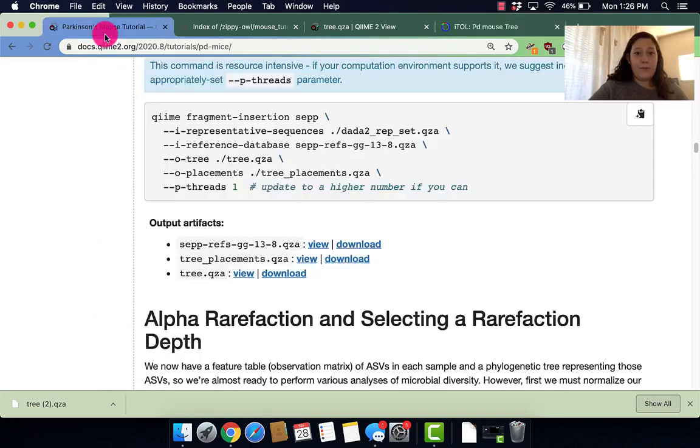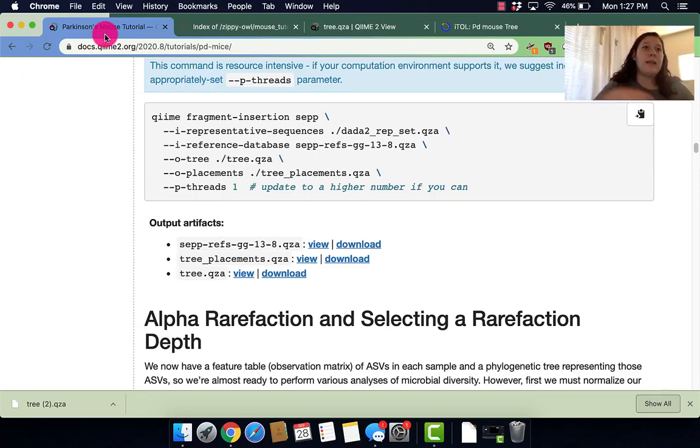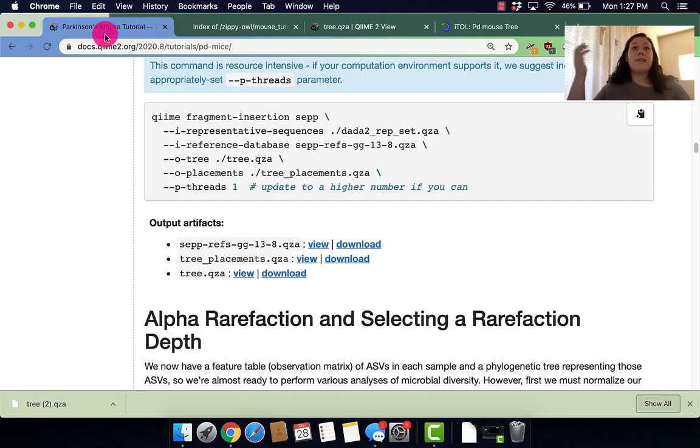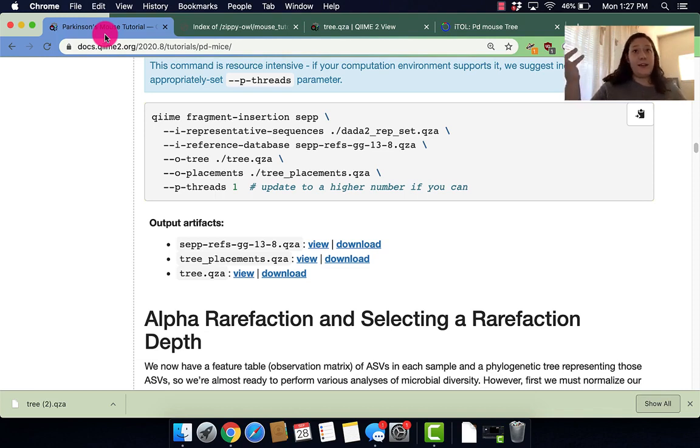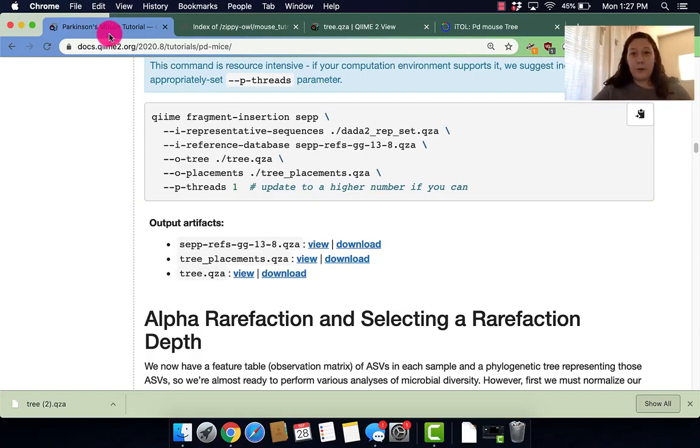Very cool. And with that, we have completed this section of the tutorial. So in this section of the tutorial, we learned how to make phylogenetic trees for QIIME's diversity metrics. Making a phylogenetic tree is particularly helpful because it's used in most QIIME 2 pipelines. Thank you guys so much for listening and I hope you learned a lot.